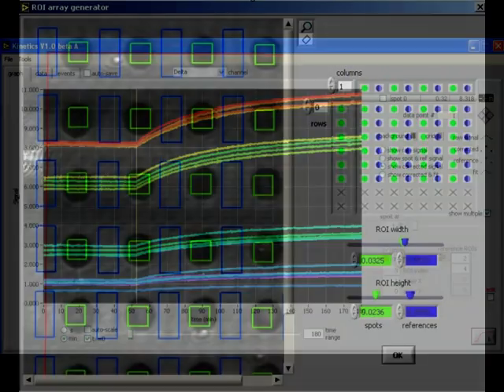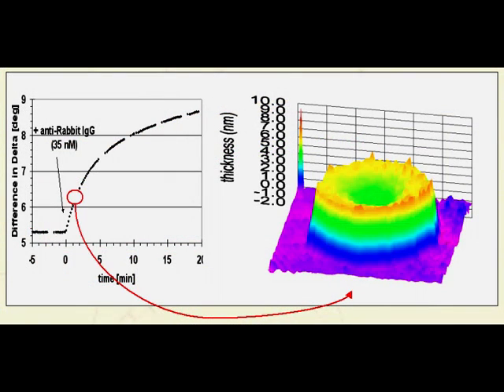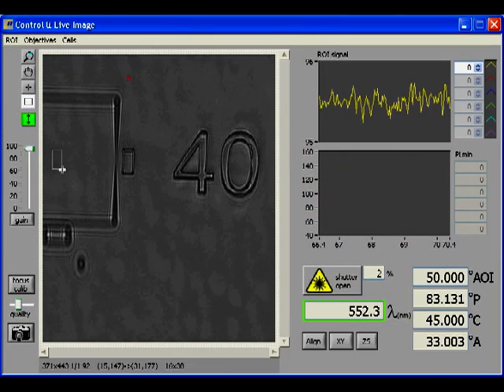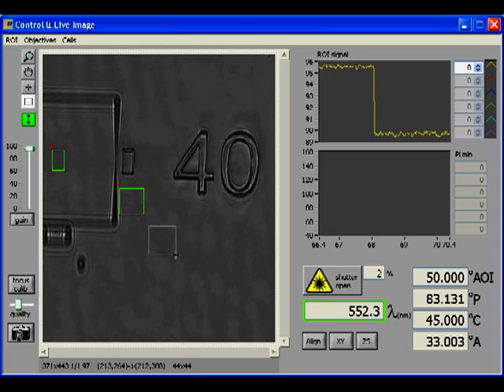Moreover, the EP3 facilitates quantitative determination of the layer thickness and further optical properties of the sample with high spatial resolution. You may measure and evaluate up to 1000 regions in parallel.